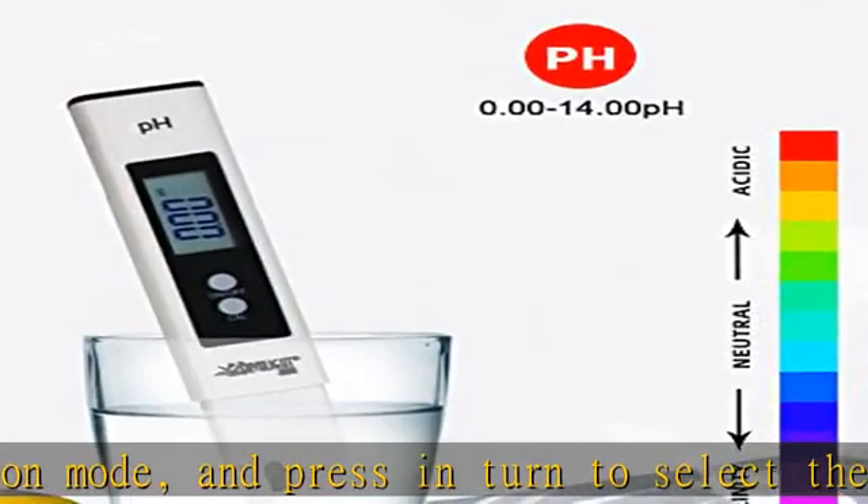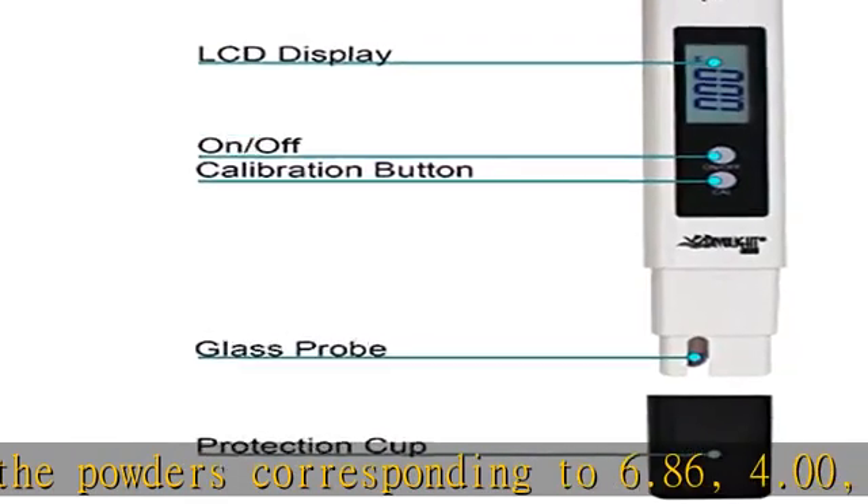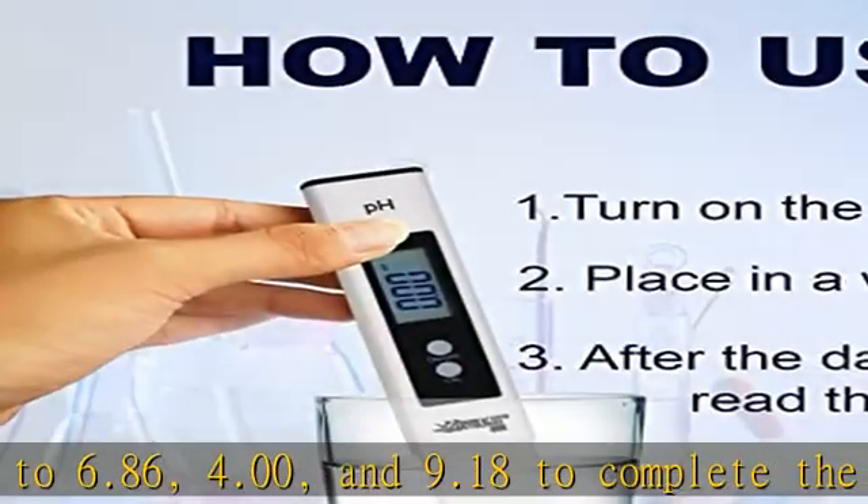It can help you make a pH test anywhere — just take it to the pool, on a trip, to the beach, camping, and more. Check the description to get this product today at the best price.